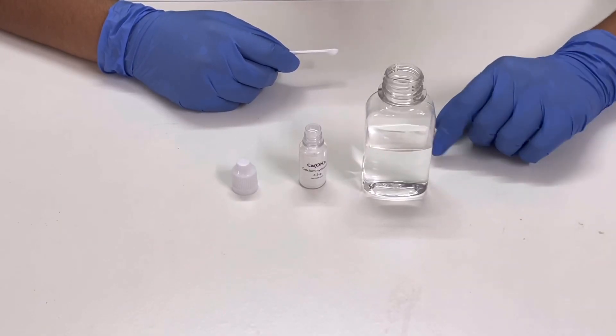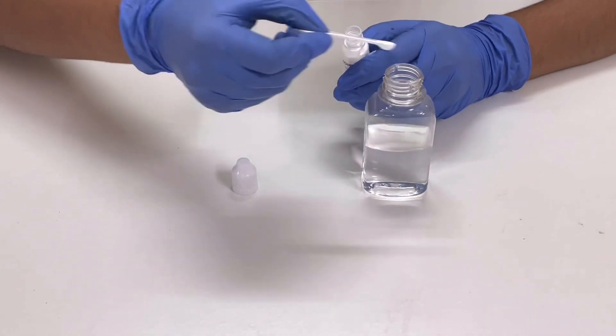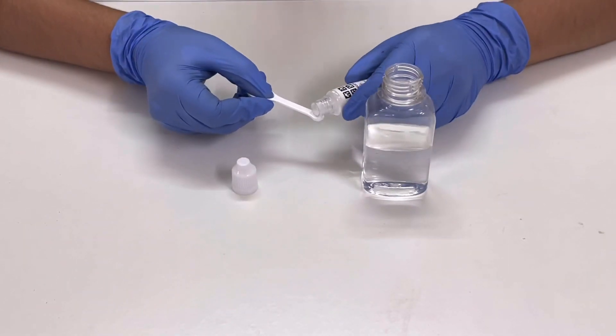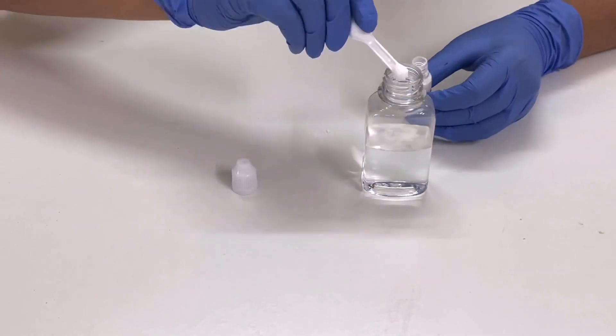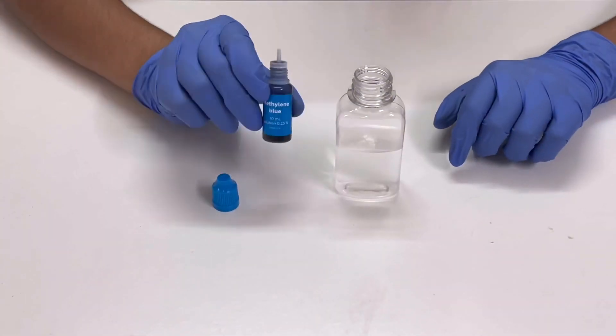I have filled water in this bottle and now I will add 2 small spoons of calcium hydroxide. Now I will add 5 drops of methylene blue.